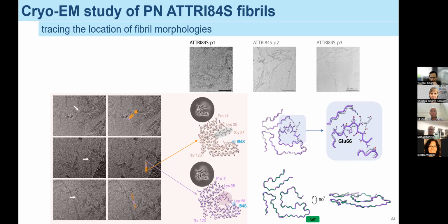So these classes are separated at 3D classification. In 2D, we cannot differentiate between these. Initially, when I started working on this using a similar pipeline to the one we were using, we were actually getting only this class with lower minima at different points. We were not sure the data quality was good, and we were not sure why we were getting minima at multiple points.